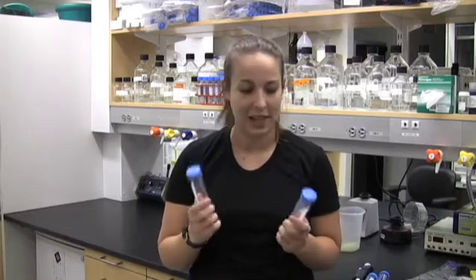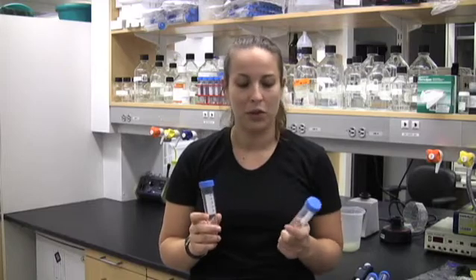Conical bottom tubes — everyone who works in molecular biology knows how important they are, but what you may not realize is how important the plastic they're made out of is. You have two different types: polypropylene and polystyrene.